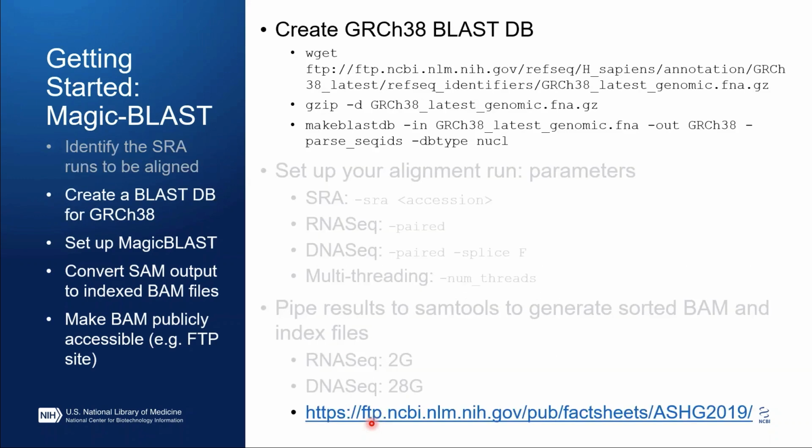Our next step is to create a BLAST database and to generate the necessary alignments. As I'm going to show you here, this really just takes a couple of quick and easy steps. The Magic-BLAST help documentation provides a really nice example that demonstrates how simple it is to set up the GRCh38 BLAST database. It's really 3 lines of code right here, and you can just use this yourself, and you will get yourself a BLAST database set up.